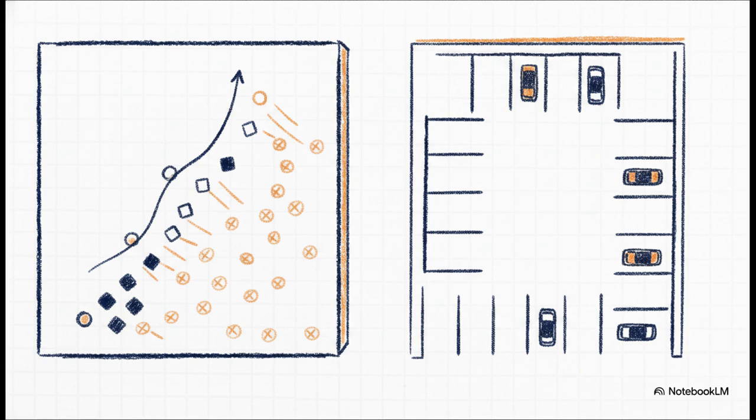The leading edge of your sample grabs the best, most available spots on the silica. With those sites taken, the capacity diminishes, and the molecules trailing behind are forced to physically spread out further up the plate just to find a parking spot. And boom, you've got an elongated spot.